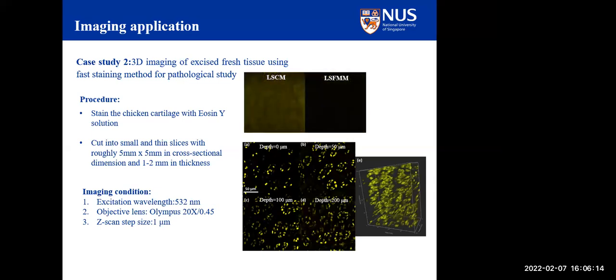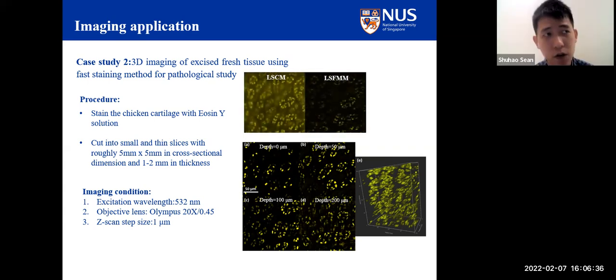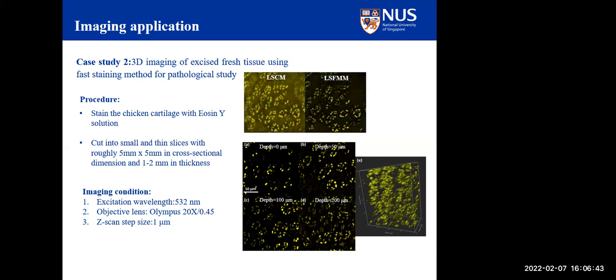Okay. I'm asking because a lot of us are working with bacteria. So 20 times might not be enough for most of us to be able to image bacteria in a tissue. I think in our case, we would definitely need something like 40 times or 63 times. Yeah, 40 times should be fine for large working distance. I see. Okay, that's all. Thank you very much. Thanks for your question.